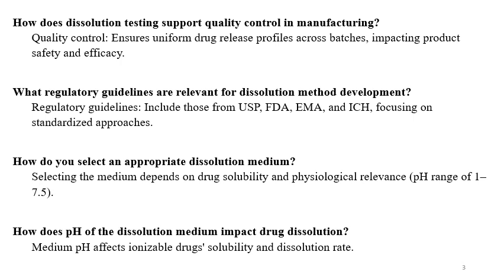How does dissolution testing support quality control in manufacturing? It ensures uniform drug release profiles across batches, impacting product safety and efficacy. What regulatory guidelines are relevant for dissolution method development? Guidelines like USP, USFDA, EMA, and ICH are focusing on standardized approaches.